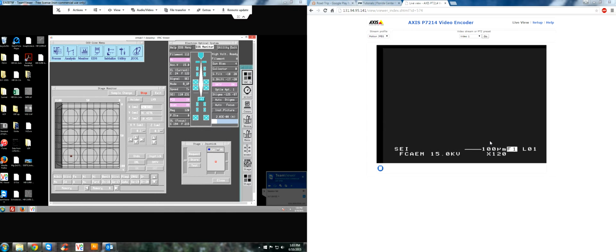Finally, it's time for quantitative analysis. This is under the assumption that either you've done standard analysis and you have your standards ready for your quantitative analysis, or we've done the standard analysis for you. You should let us know ahead of time so that we can do that.